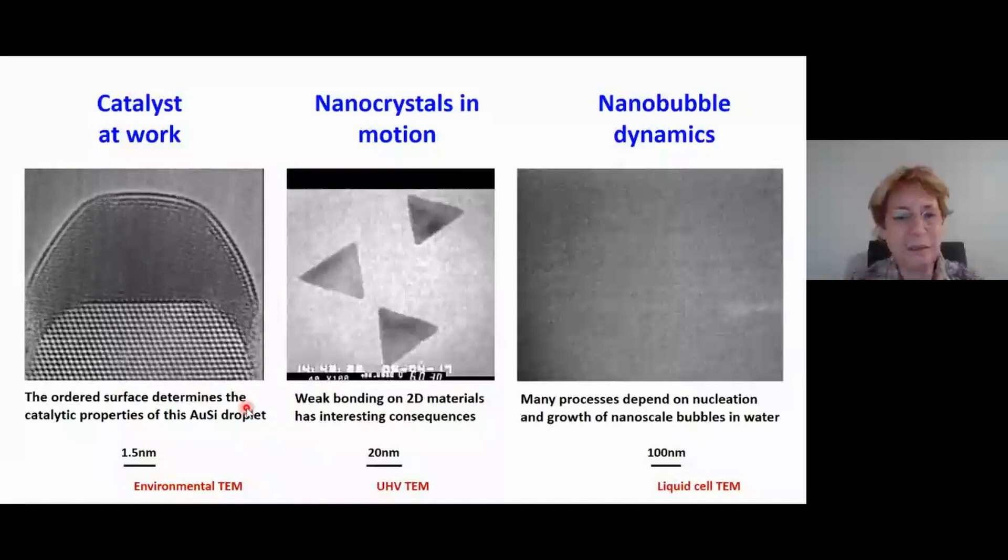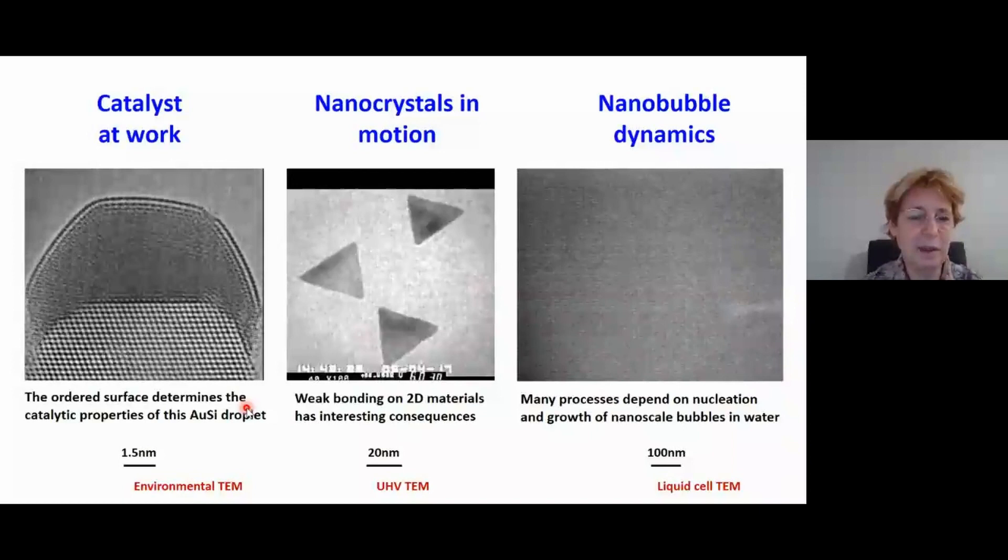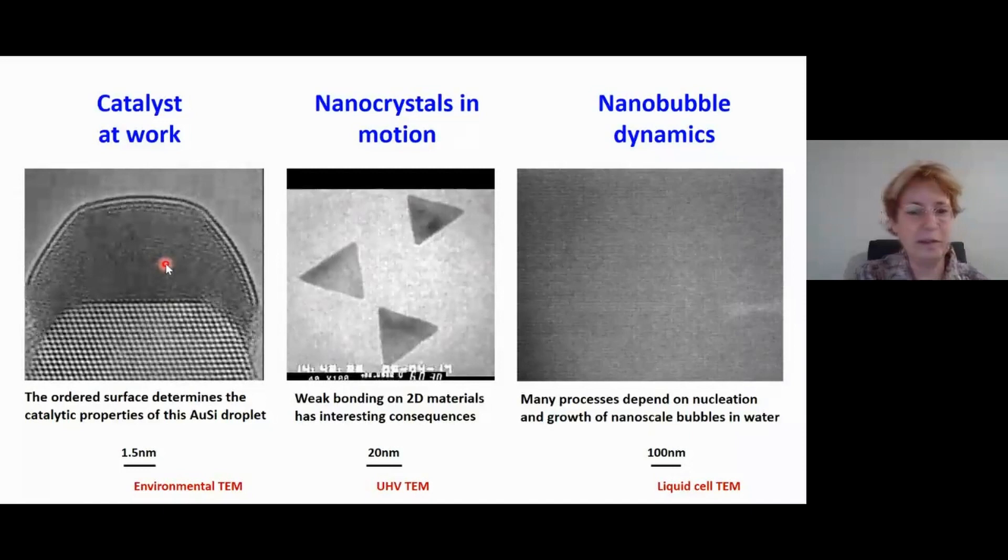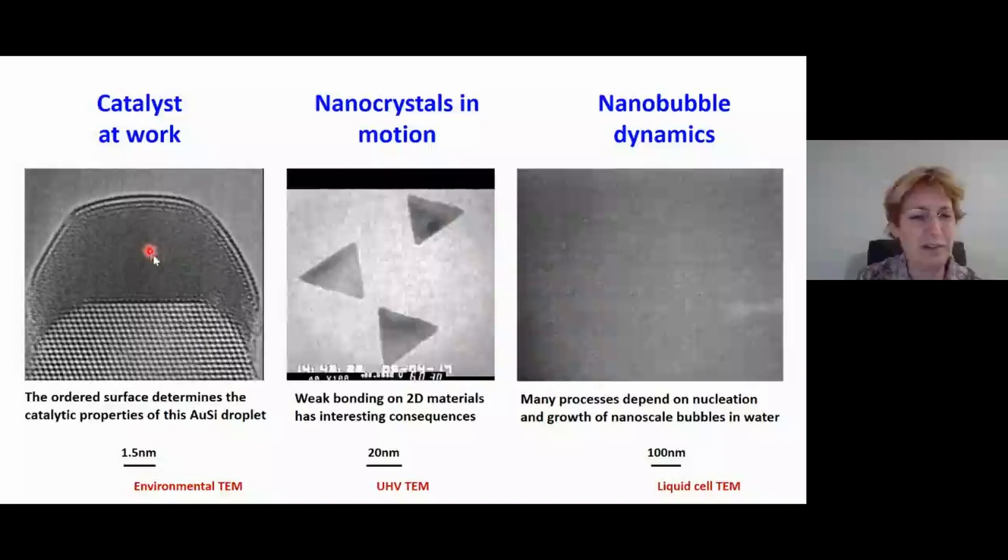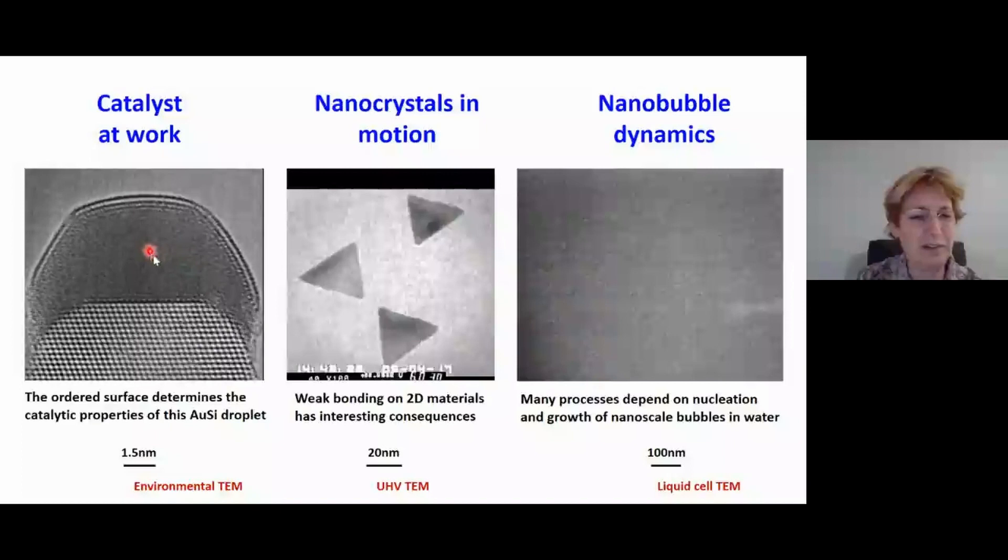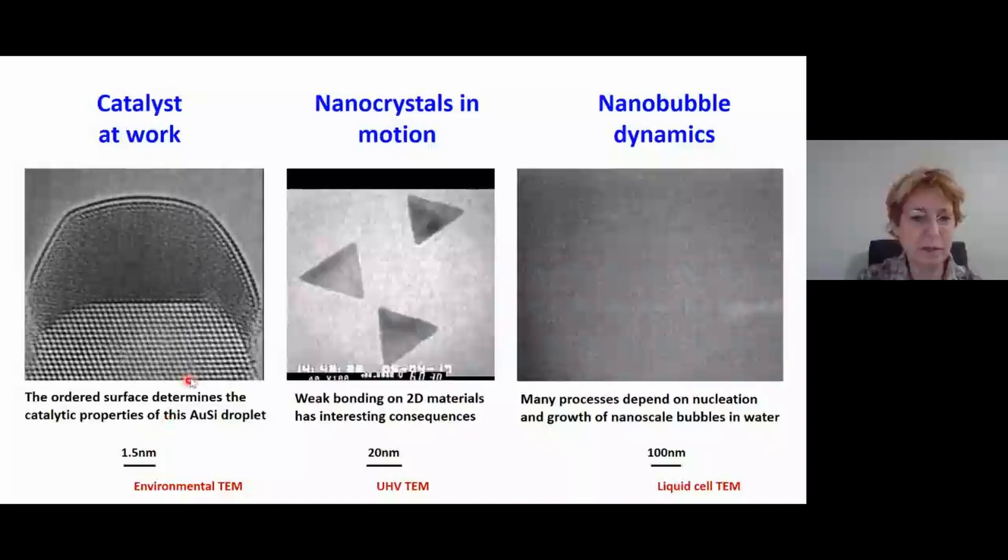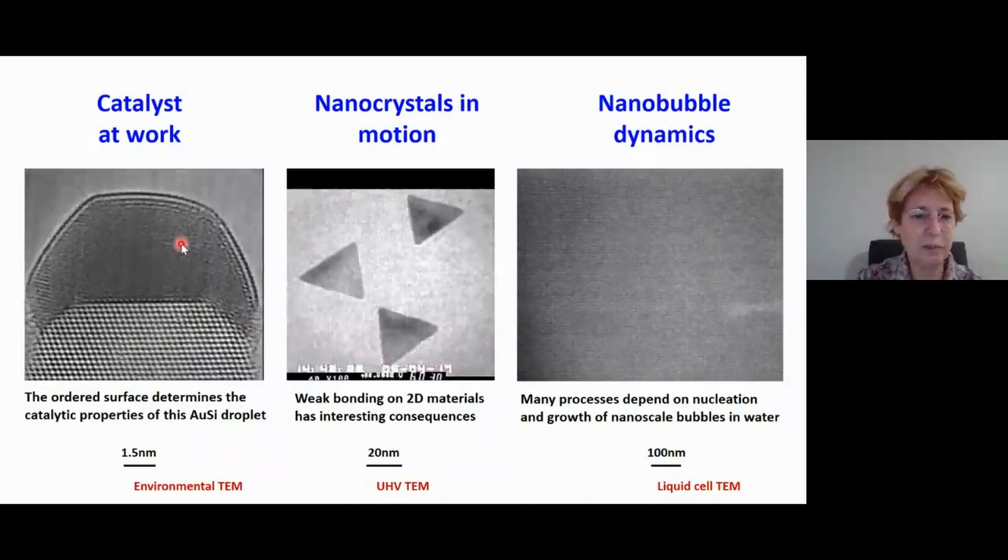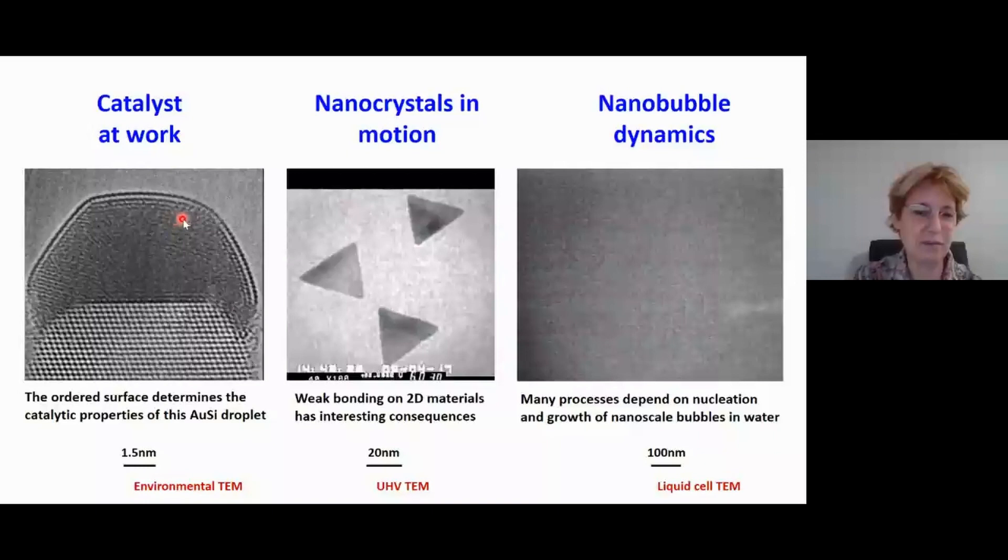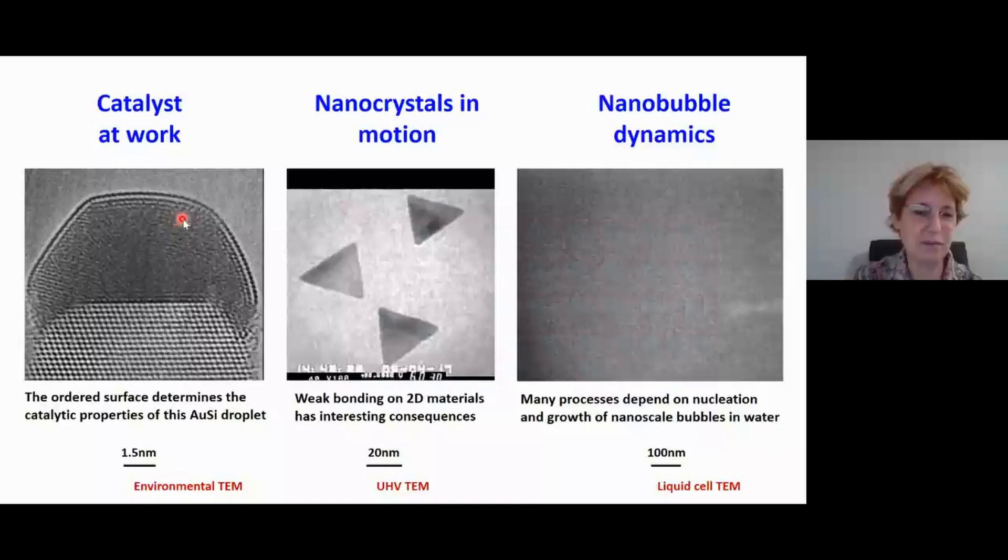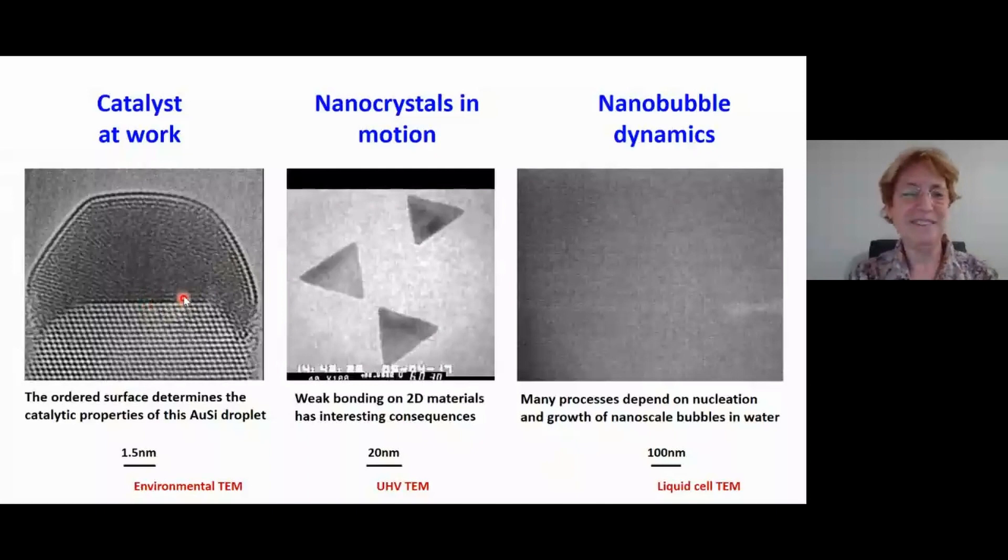So this is the kind of thing that I'm interested in. I'm showing you a few examples here. The first one is a catalyst at work. This blobby part here is a gold silicon eutectic liquid catalyst, and its job is to catalyze the formation of silicon into a crystalline nanowire. Just look at the dynamics of this thing going in the microscope. You can see in this kind of environmental TEM, where we flow gases and typically heat up the sample, you can see lattice resolution of the silicon structure, the liquid droplet, and the dynamics recorded at 400 images a second.